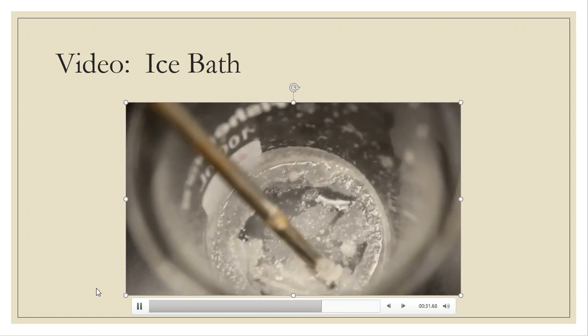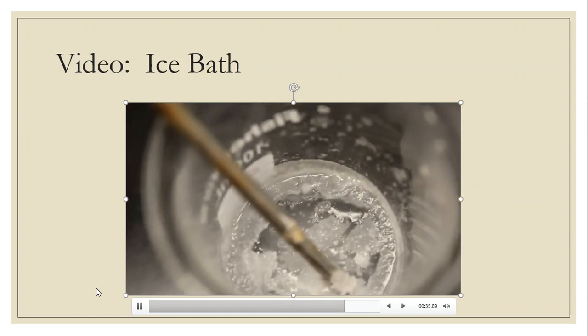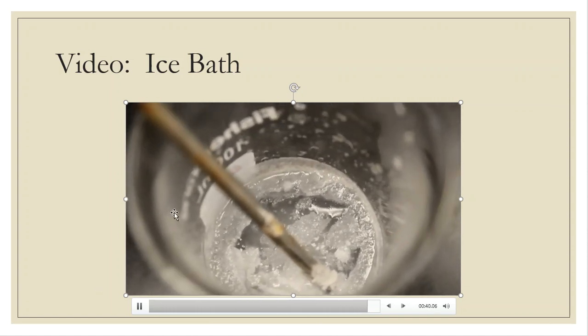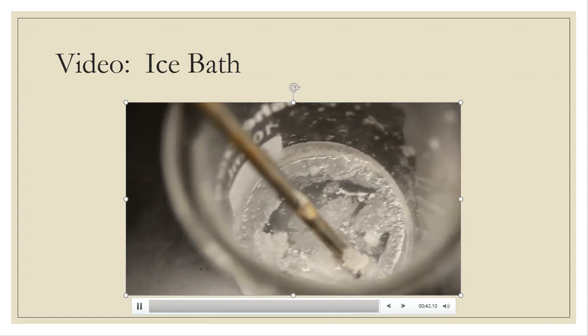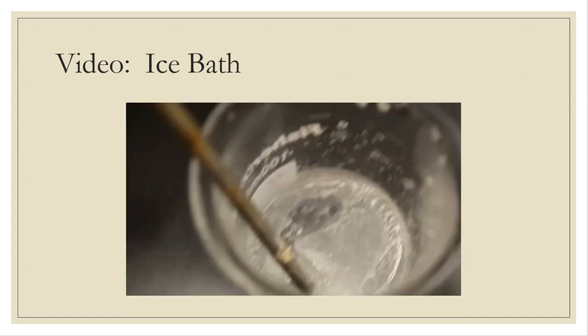So that is not surprising to me, as long as I've read the lab procedure before coming into the lab, right? So I'm getting ready to transfer this with the solid into a separatory funnel, add some methylene chloride, and begin to extract the organic that's out of this water right now. Okay, so this helps ensure that my alkane really does fully separate, but it also helps ensure that my temperature is suitable for the extraction solvent, which is methylene chloride, that's going to come next.